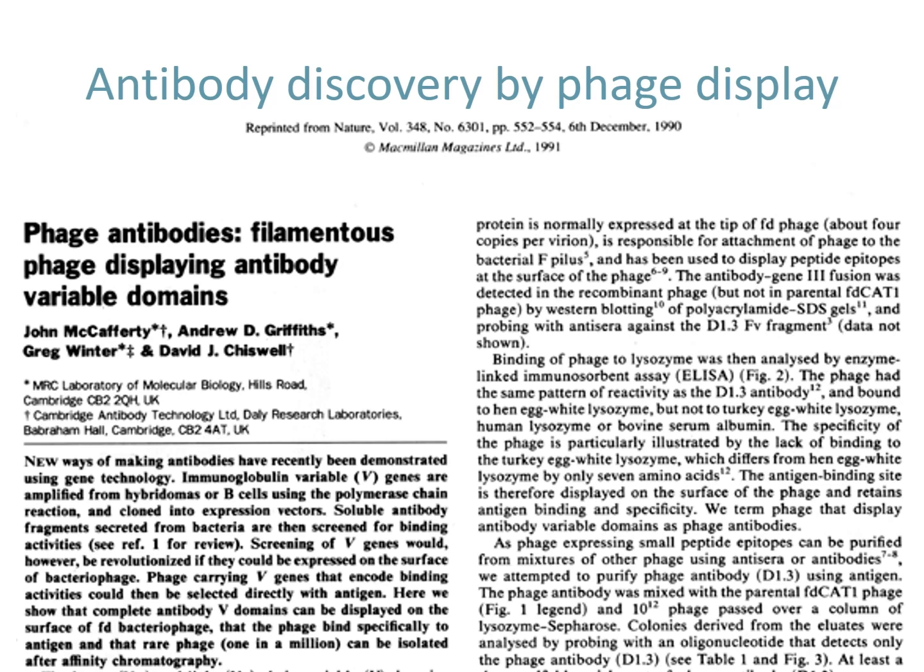What we were able to demonstrate was that we could clone antibody genes in such a way that when a filamentous phage particle was produced from that cell, it displayed the encoded antibody on the outside with the antibody gene itself encapsulated within the bacteriophage particle. And in that way, we had created a link between the gene and the binding molecule which it encoded, and we were able to demonstrate that we could actually isolate specific antibodies from large mixes.